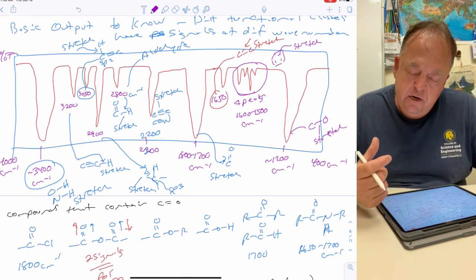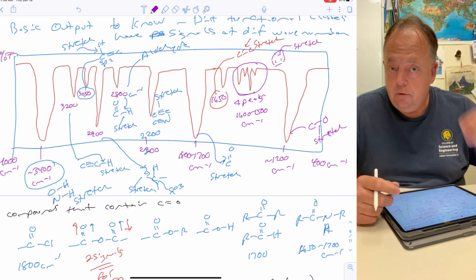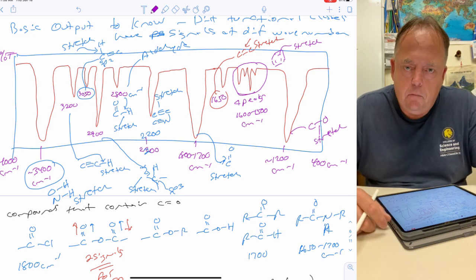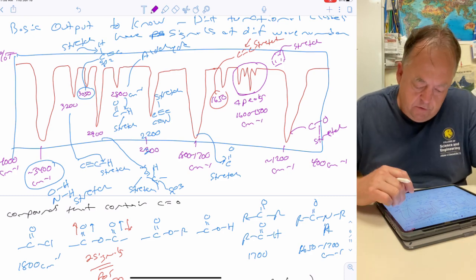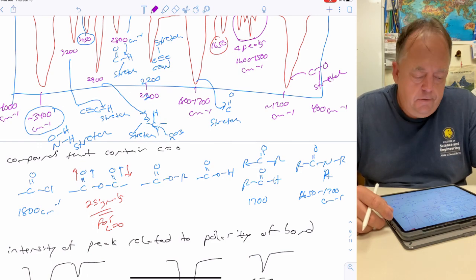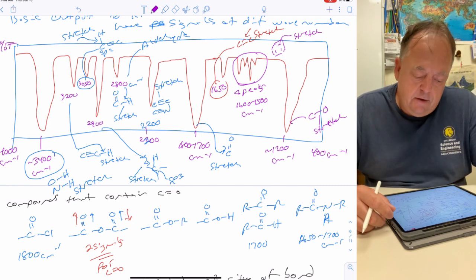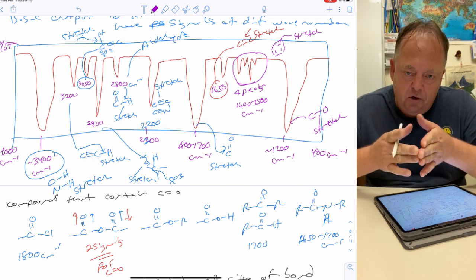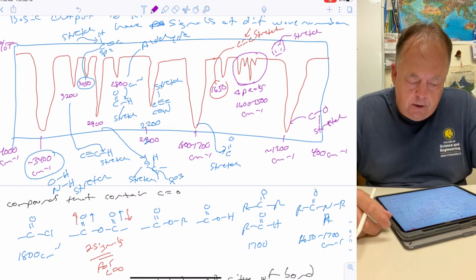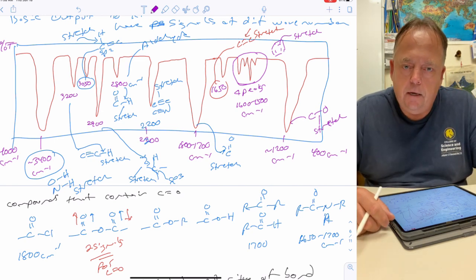Okay, so all of those are very characteristic. So it tells you a lot about your molecule, right? If you have a peak around 1750 in your IR, you have a C double bond O in your molecule. So if you're trying to figure out the structure of a molecule, you better have a C double bond O in it, right? If you had a peak at 2200, of course, it doesn't have to be exactly 2200, just right around that region, 2250, fine. But right around that region, you have a molecule with a triple bond in it.